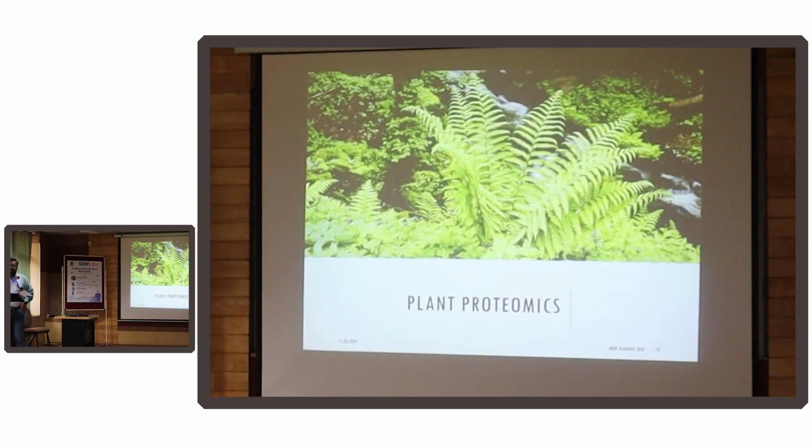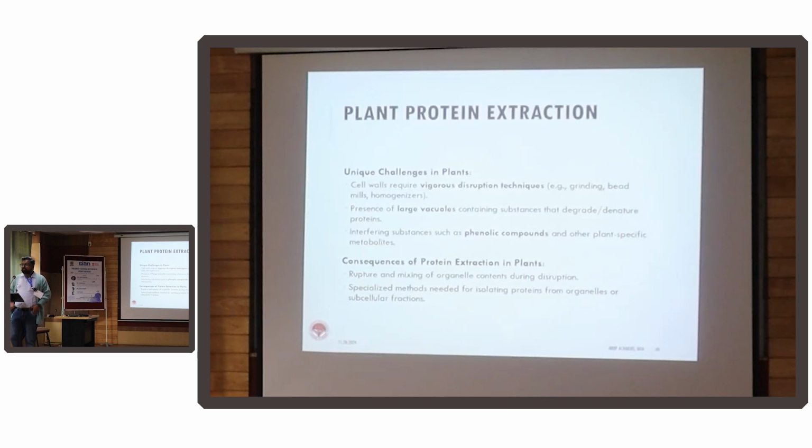So, plant proteomics. I think a few of you yesterday told me that you would like to see how we use plant proteomics. Plant proteomics comes with a unique set of challenges, which we'll discuss first. The first unique challenge is that it's a very strong cell. It has a cell wall.